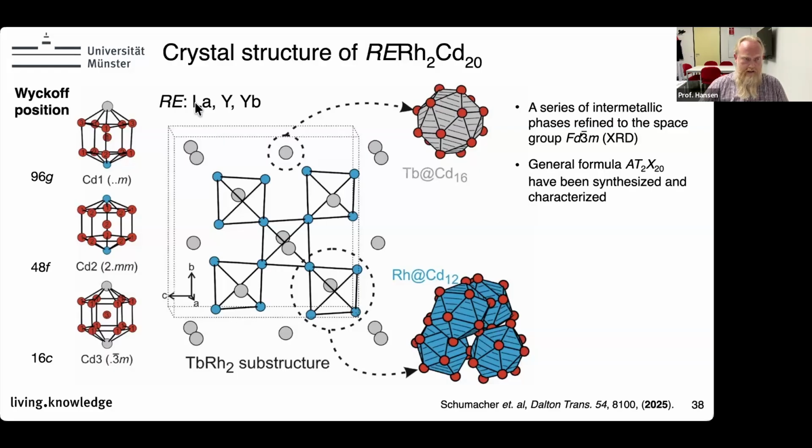What's special about this is that the rare earth elements sit at the edges and have really high symmetry. So for the rare earth elements we expect constraints such that you don't expect any quadrupolar coupling or any broadening due to being on a non-symmetric point in the crystal structure.